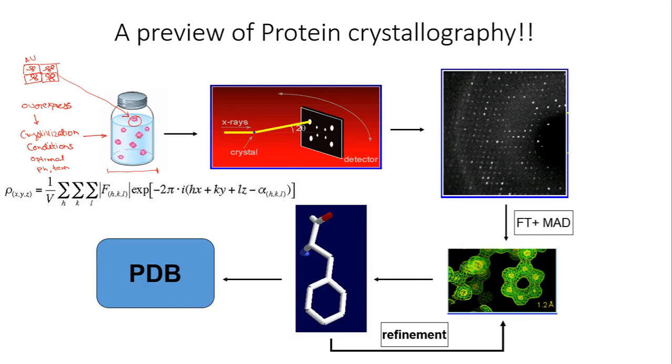Okay, so these are very small and microscopic. This is what happens in your crystals. The protein molecules get arranged one upon another to form a crystal of the given protein. Once you obtain the crystal, you mount that crystal on your X-ray crystallography machine.